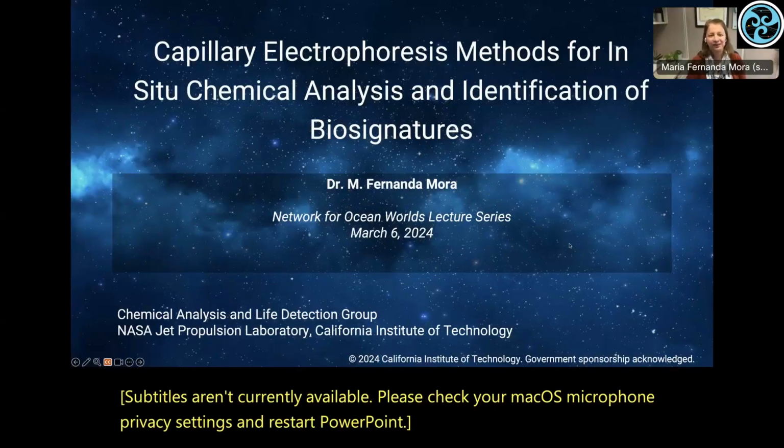Okay, so thank you for the introduction, and I think it's going to be a little complementary to the previous talk because I'm going to talk about liquid analysis, so we can analyze those samples that you get, Dennis, with our instruments. Mostly I'm going to focus on the method portion of the work that we do at JPL.